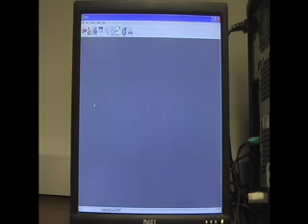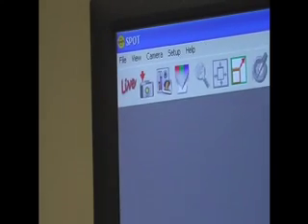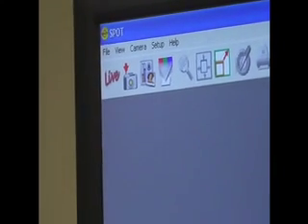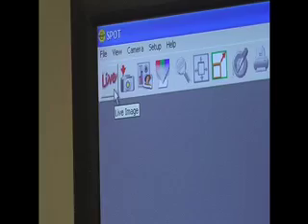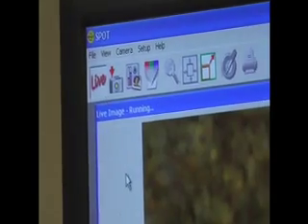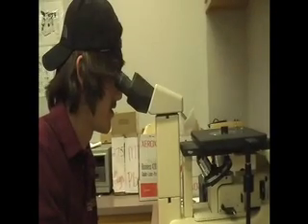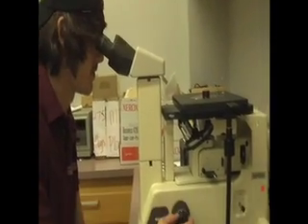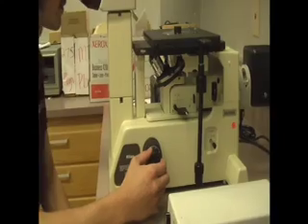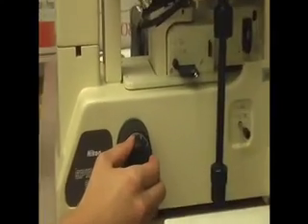Then click on the live button located in the top left corner to begin a live feed from the camera. Look through the eyepiece to view your sample. Use the coarse and fine adjustment knobs to bring your sample into focus.